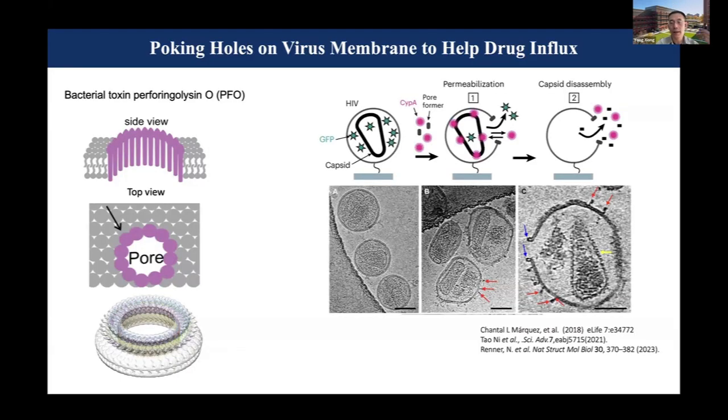So this has been done before, actually, looking at the mature HIV virus by Theo Barkin's group for imaging studies and Pei-Jun Zhang's group for cryo-EM studies to basically increase the contrast or let small molecules diffuse in and out of the lipid envelope. So these are done in mature virus. The capsid is separated from the lipid envelope.